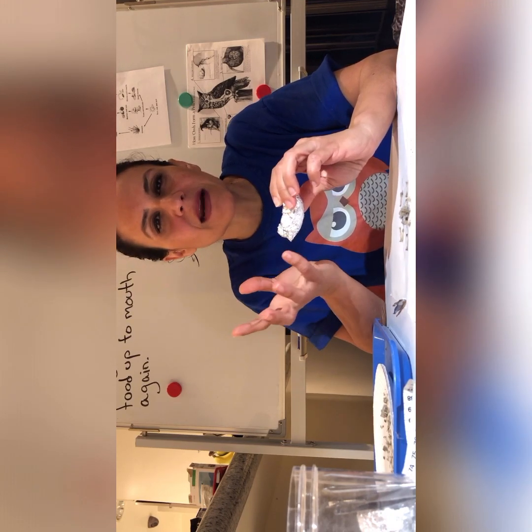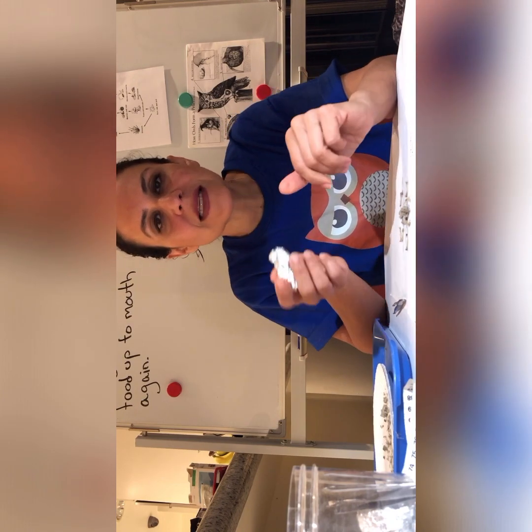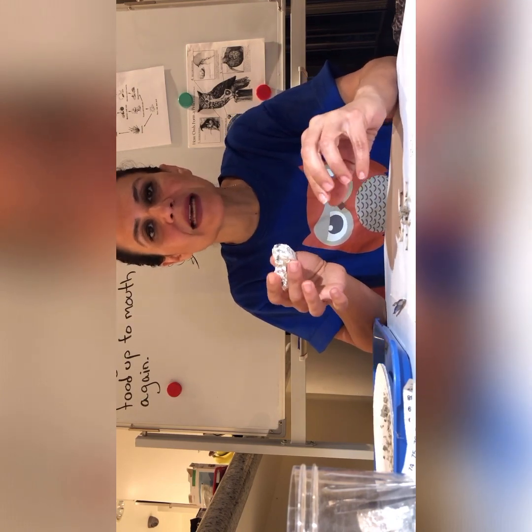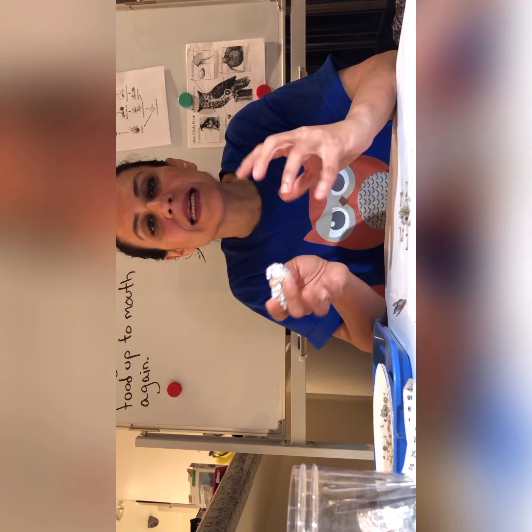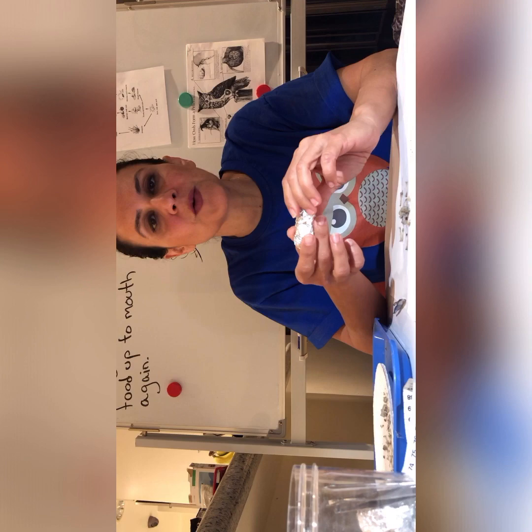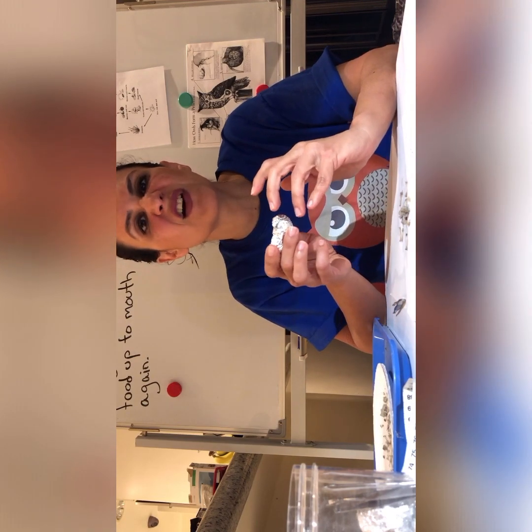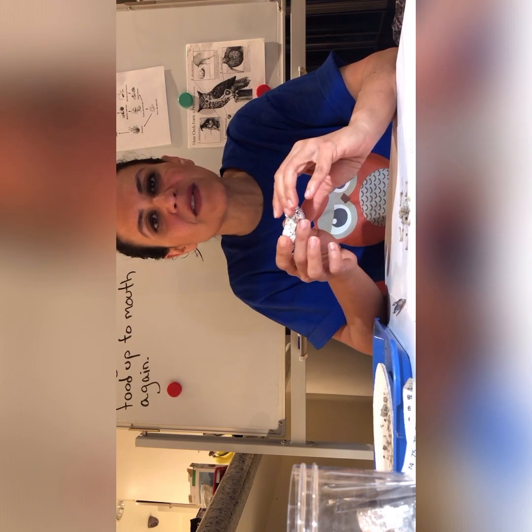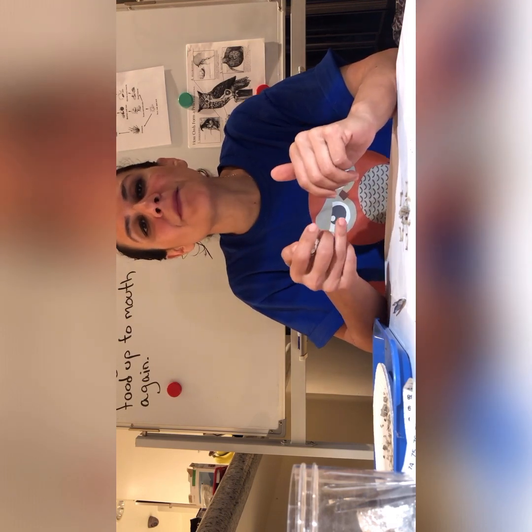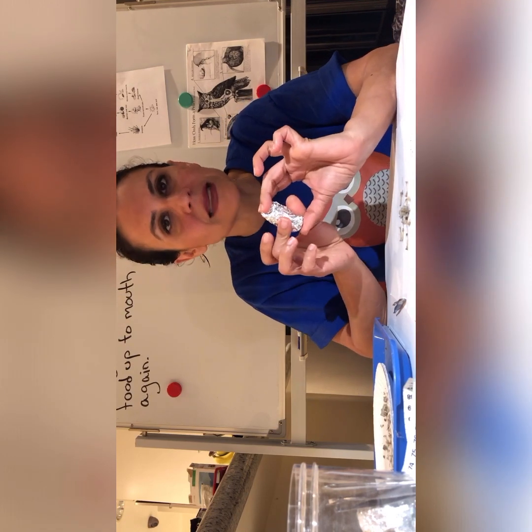So it eats the animal whole, and it secretes enzymes and all sorts of acids, stomach acids, and it eats up all the parts, the flesh and everything that it can consume. And it's left with the bones and the fur and the teeth and all the exoskeleton of the animal. And it brings that back up through its mouth, and it forms this tiny little pellet.